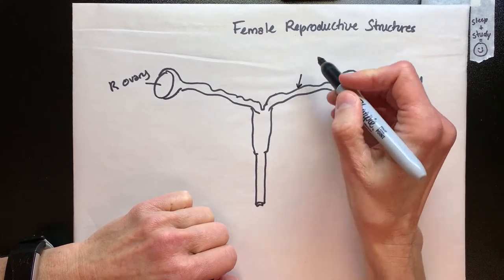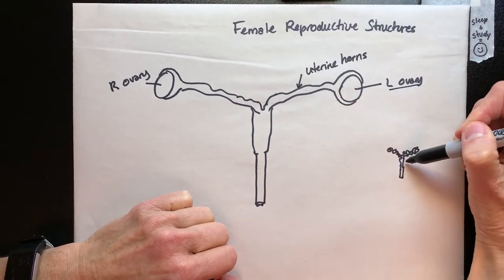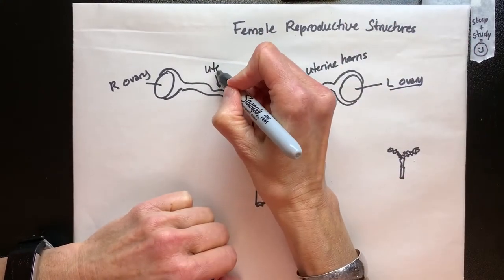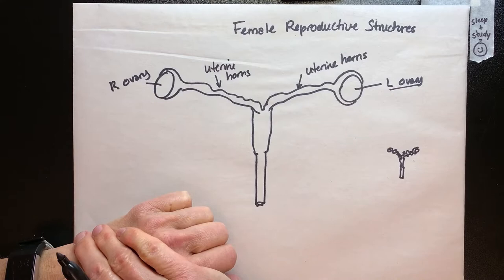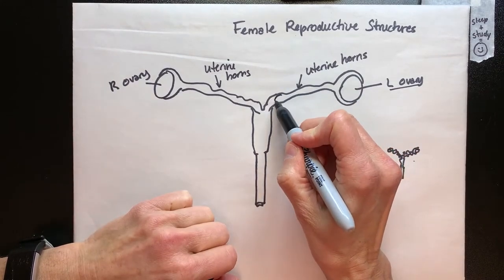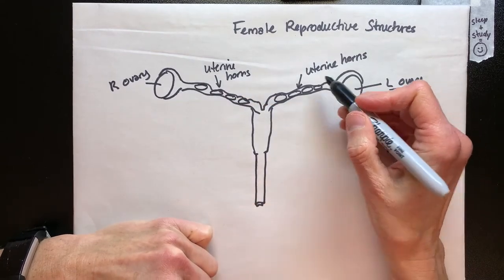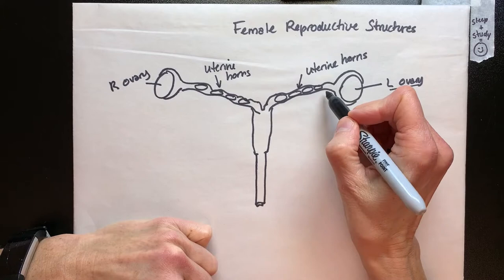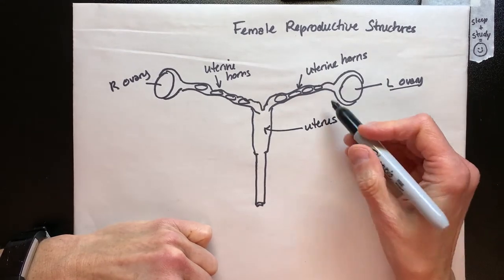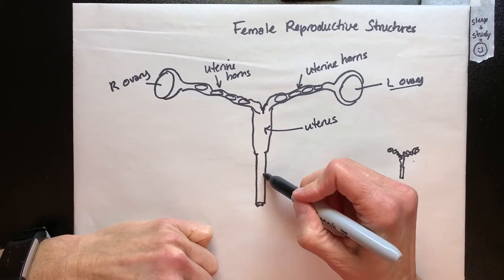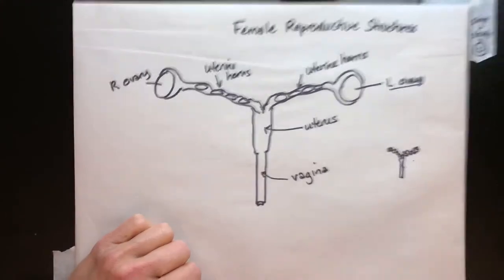The ovary is attached to what we used to call the fallopian tube, but now renamed the uterine tube, because that's more specific. In the fetal pig, however, we're going to call these uterine horns. The fetal pig, dog, and cat all gestate their young in these tubes — kittens, pups, and fetal pigs all develop inside the uterine horns, not in the uterus. The uterus leads to the vagina, and that leads out the exit. So that's the female reproductive structure of the pig. It'll be behind the urethra and in front of the rectum.